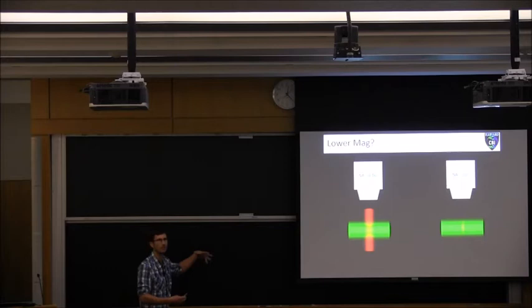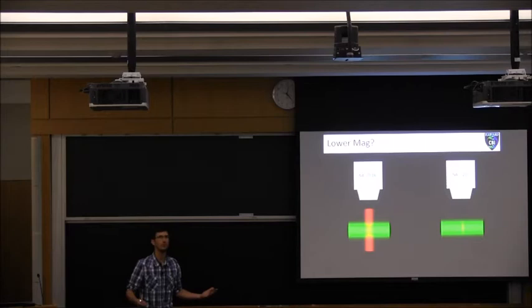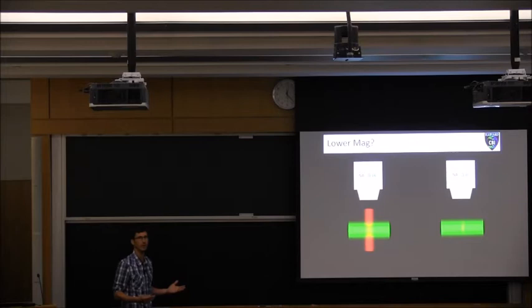So if you go to a 5x objective on a confocal, yes, you get a nice big field of view, but you get absolutely terrible deep resolution. And the confocal actually is going to make this a little bit better, but it can't make it anywhere near this, unless you have the numerical aperture for it. So this is the reason you don't want to go down to a 5x objective on a confocal for imaging clear tissue. It's just going to be an absolute mess in the Z dimension.